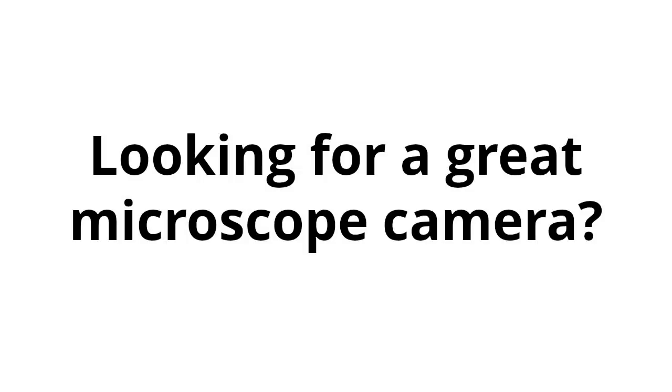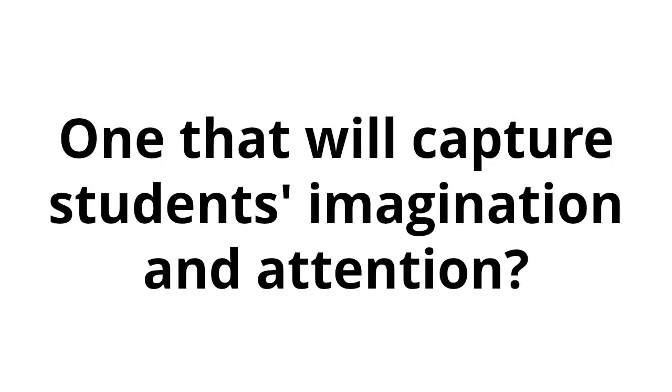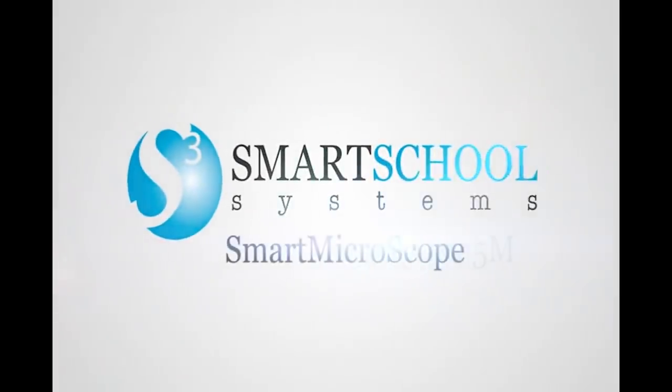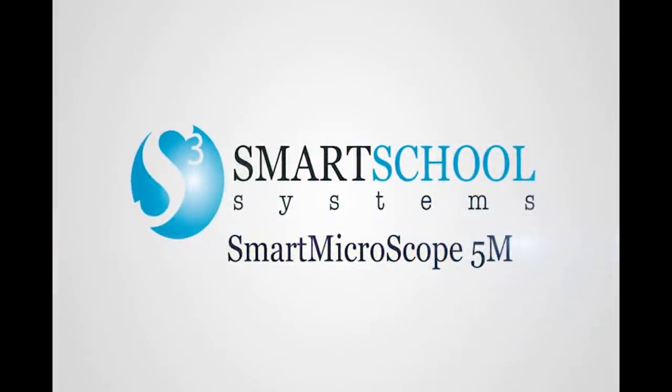Microscope camera. Looking for a great microscope camera? One that will capture students' imagination and attention? Hi, I'm Shannon. Here to give you a quick overview on the SmartScope 5M.